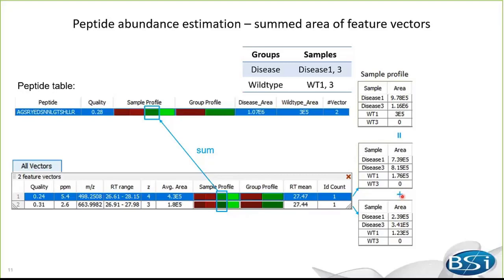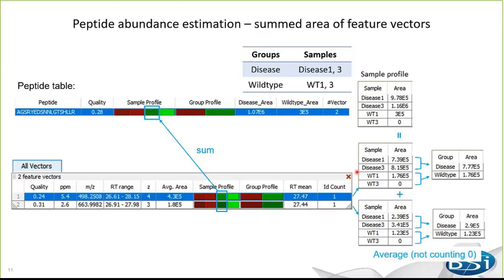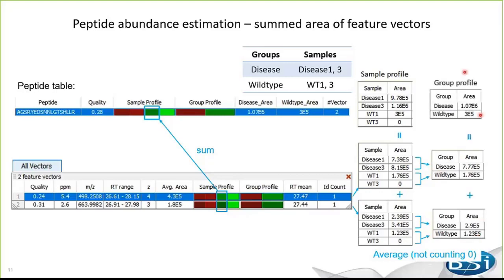The peptide abundance in a sample is the sum of its feature vector abundances. As detailed on the right-hand side, in this project I analyzed four samples: two disease samples and two wild-type samples. This table shows the sample abundance profile of the charge-4 peptide. Below is the sample abundance profile of the charge-3 peptide. The sum of charge-4 and charge-3 peptide area in disease-1 sample is shown as the peptide abundance in this sample.